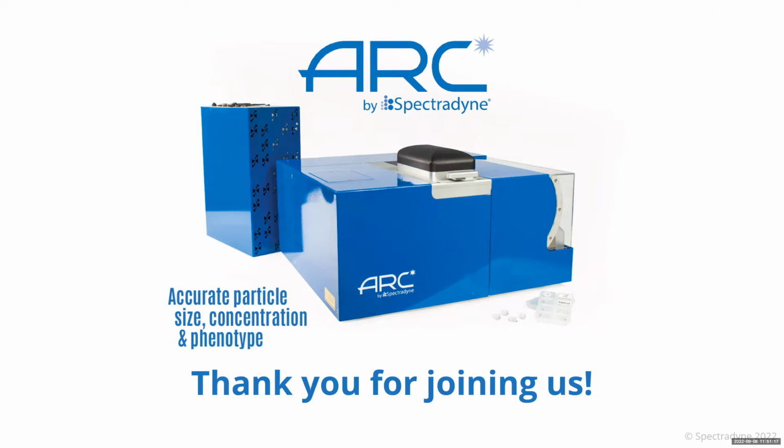One last question here I've got from Peter Hauer. Is the detection confocal? And I'm not sure quite what he means with that, but I think I know what he's getting to, because then he proceeds to say, what are the chances of double events in the optical channel? Do the time resolution of MRPS and optical detection match?